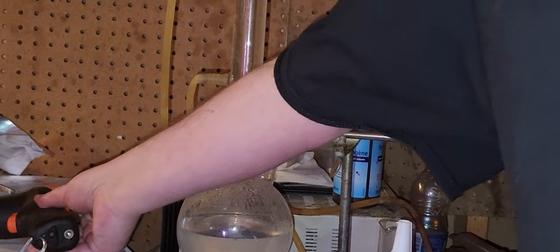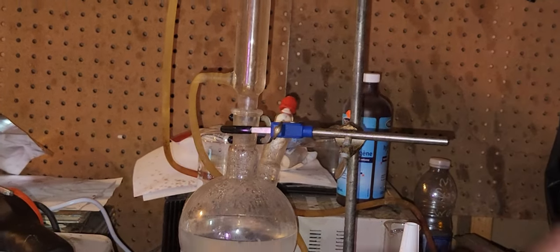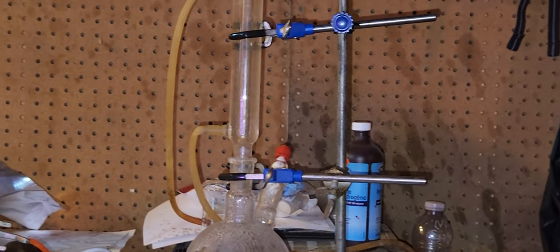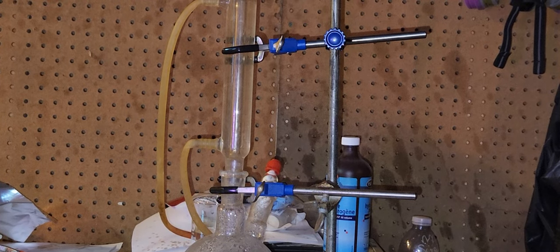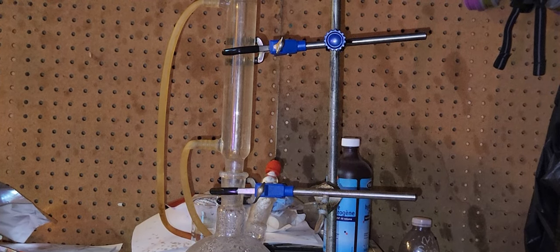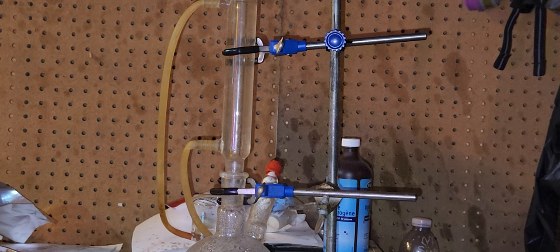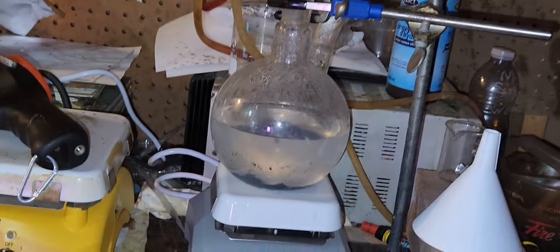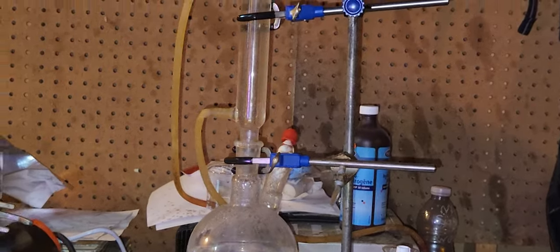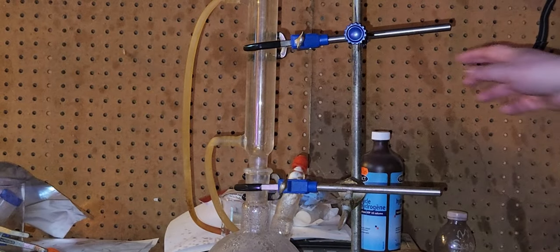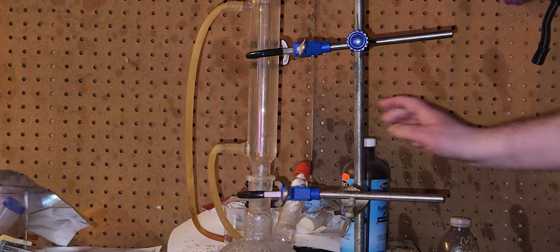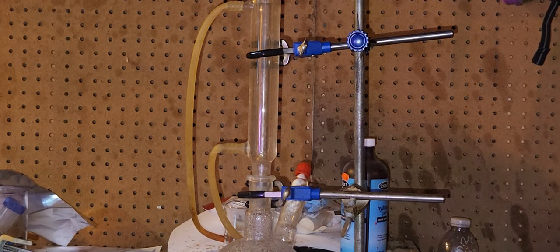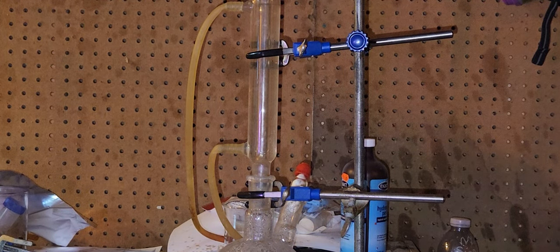The temperature is 52.2 degrees Celsius. If the method is too slow, I need to add 35% hydrogen peroxide. Right now I only have 3%, and I've been adding about 100 milliliters, but it won't do much because it's not strong enough.